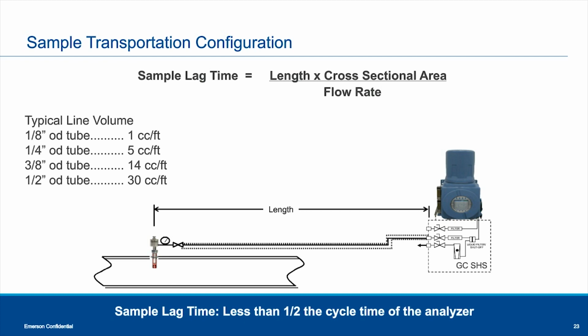We'll see people say, well, let's run it as fast as I can then. And when we talked about the contamination issue, sometimes getting your sample from the probe to the GC quickly doesn't always do you a lot of good if you haven't fixed the other delays in the system, in terms of where the probe's located for the process, as well as what your analyzed time is.